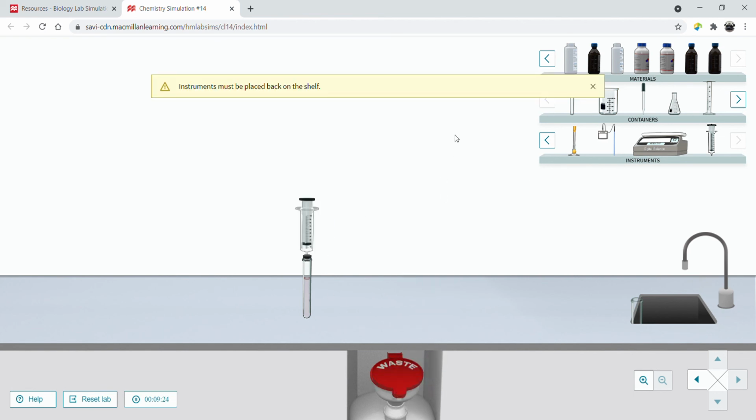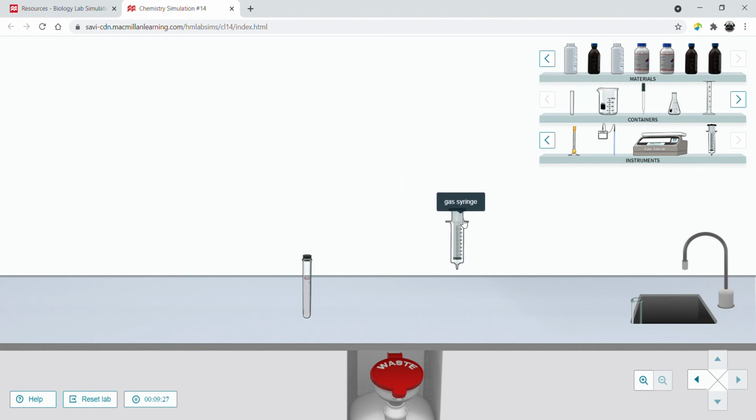So you have those numbers. Okay, so given that information, those numbers that we just read out, go ahead and answer that question under the table. So make sure you have your hypothesis, your table filled out, and answer the question underneath. And that is what you're going to upload to the submission link for your points for this particular lab. All right, we're done. Take care, everyone. Bye.